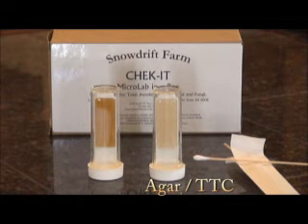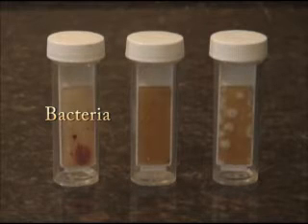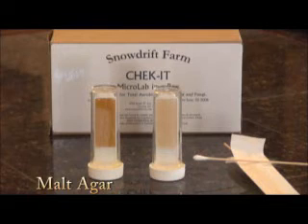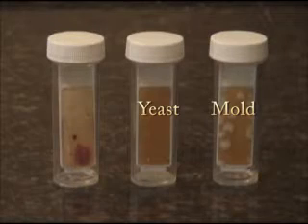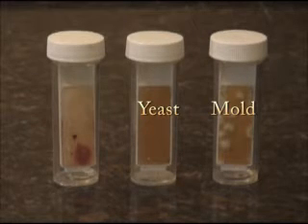The lighter colored side of the test contains agar and TTC and will determine if your solution contains any form of bacteria. Bacterial colonies are displayed as red dots. The darker side of the test contains malt agar and gives results for yeasts, mold, and fungi. On the malt side, the colonies appear as shiny, clear spots or hairy growths.